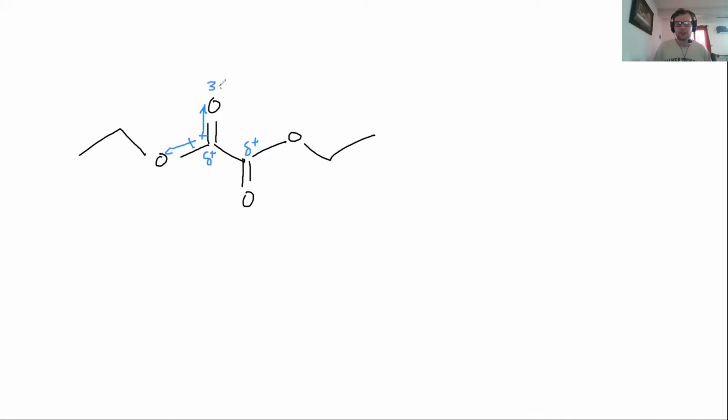So oxygen has like 3.44 or whatever, and carbon is like 2.8 or something. Anyway, you're going to have positive centers and negative centers. And so this is going to be very positive. And so if we get an electron shot at this molecule, it's going to be attracted to that positive charge center and kick up an electron, and it's going to fragment this molecule.